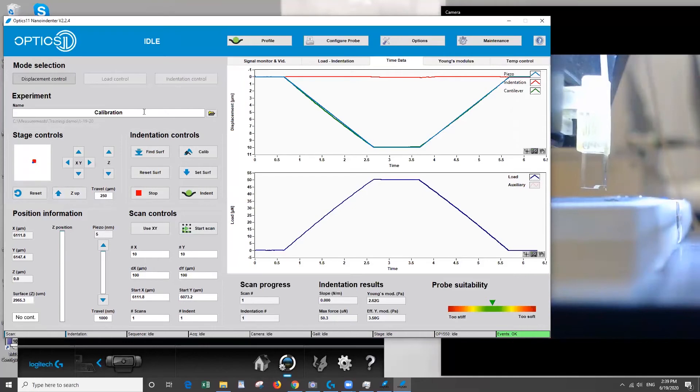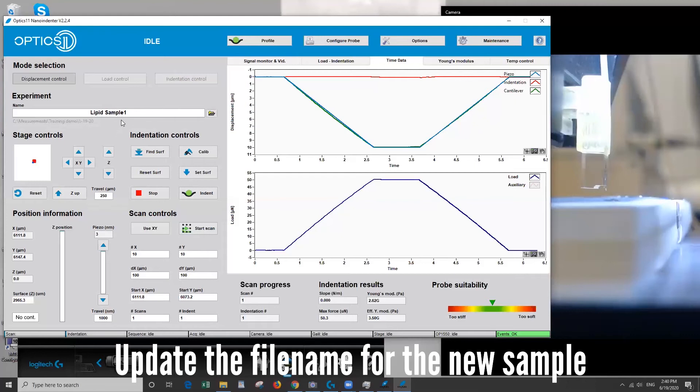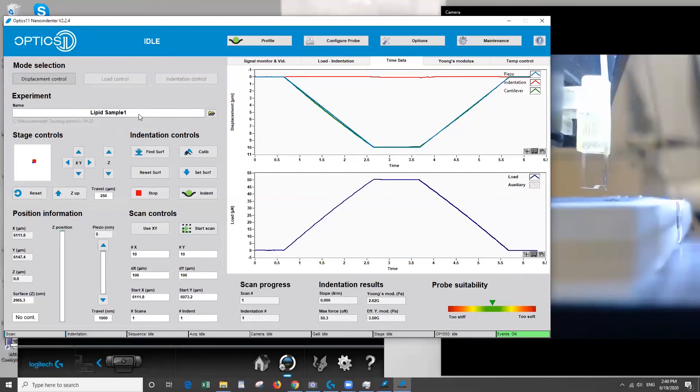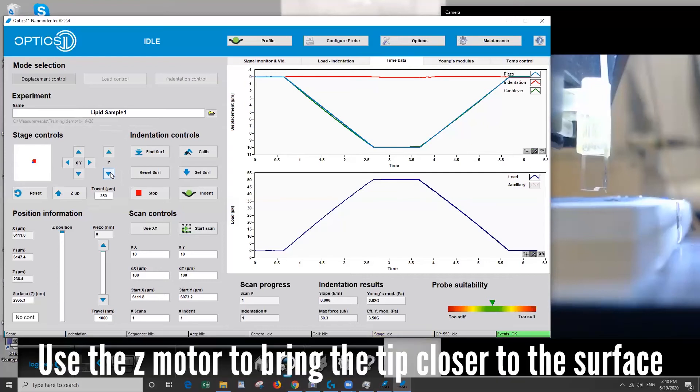Okay so first before we forget let's change the file name to something representative of what you're measuring. This is especially important if you have multiple samples because you may get confused which force curves belong to which samples so don't forget this step. So we'll bring the tip close to the surface.